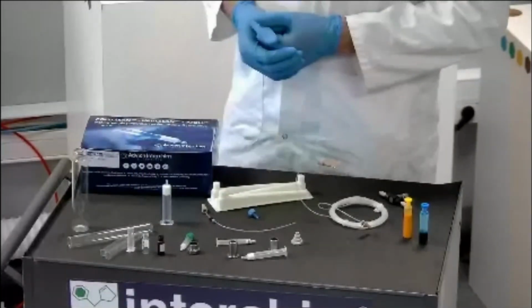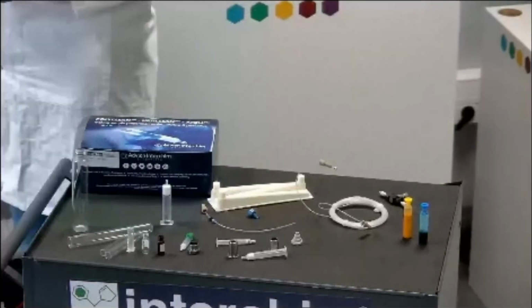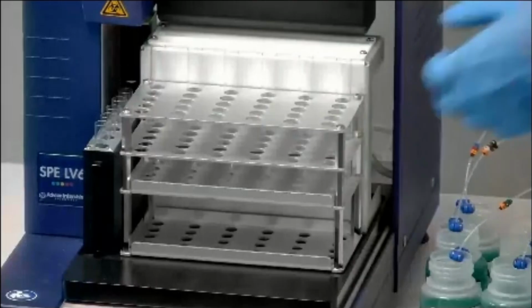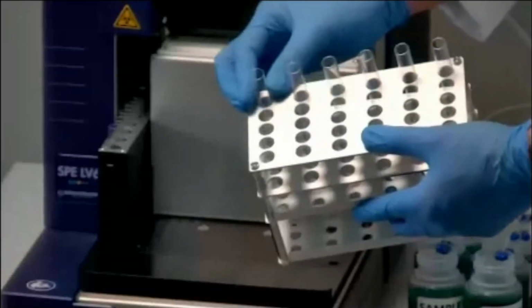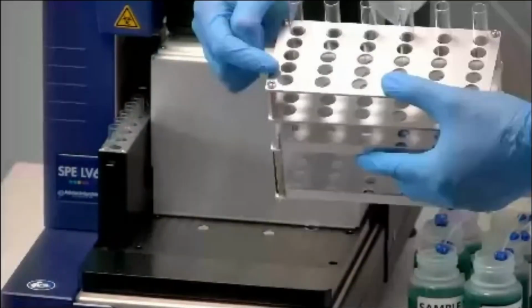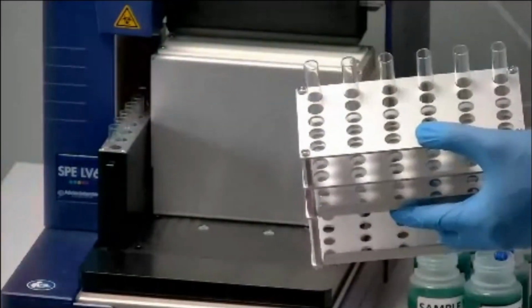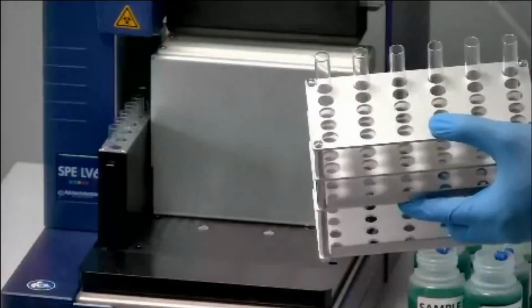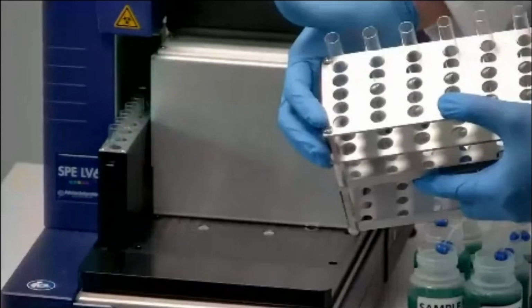If you want to collect your elution fraction inside tubes, we have different collection racks available. For example, here we have a collection rack for test tubes with an external diameter of 13 millimeters, with up to 5 tubes. So especially if you want to collect, for example, the waste, the washing step or the elution step or different fractions, you have the possibility to collect up to 5 tubes per sample.